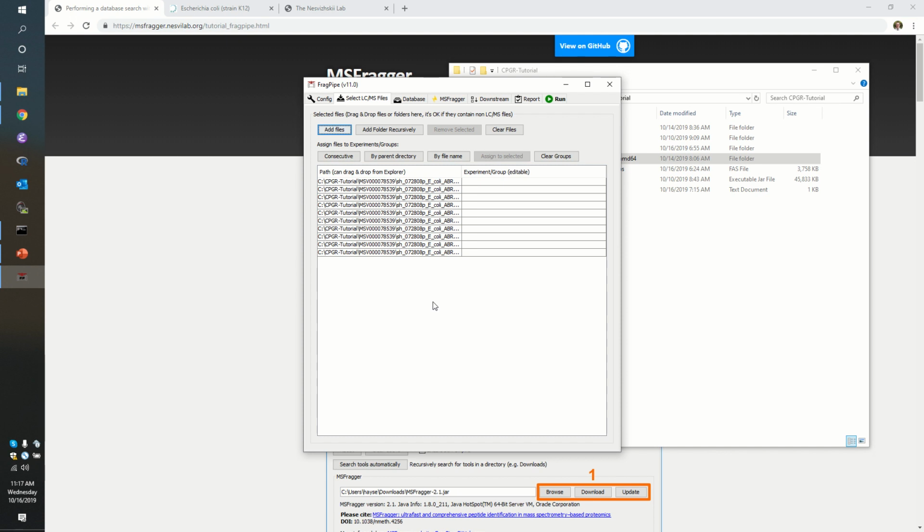Very frequently, people write their code in such a way that if there's a space in the path to the file in one of the directories that leads to it, it loses the capability of remembering the whole path together. So if you move these files to a location where there's not a space in the path, that will solve that problem. But I will be sure to mention that to the developers, and they'll catch that problem.